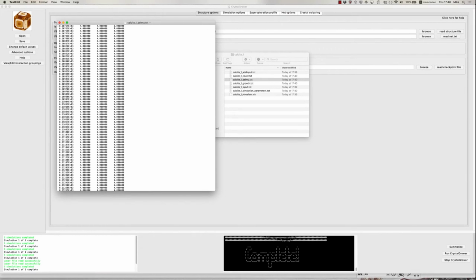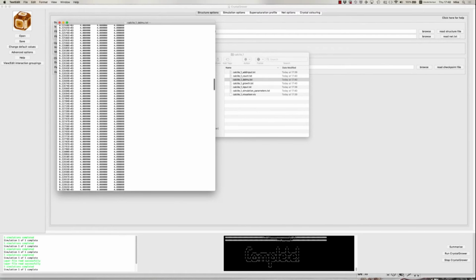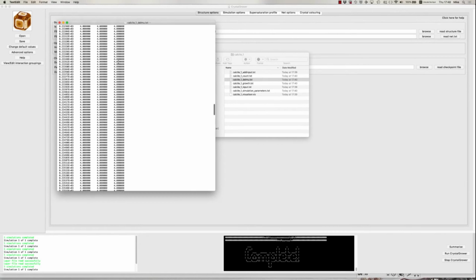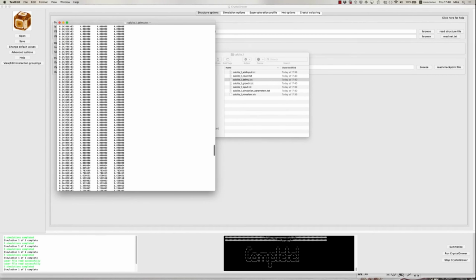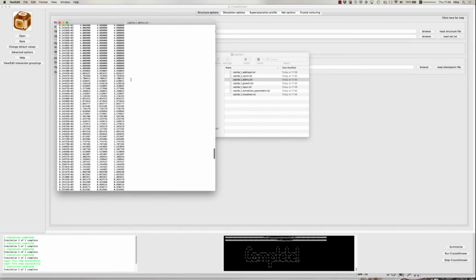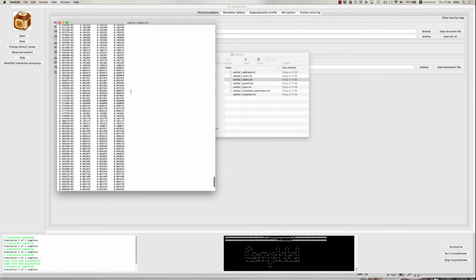If you look at this last column on the right here, we start at a supersaturation of 4, and then as we go down this file, for the first 3/4 of it that stays at 4, and then you start to see the supersaturation dropping down towards equilibrium, which is close to 0, and then you're just getting rearrangement as the supersaturation has dropped close to 0.